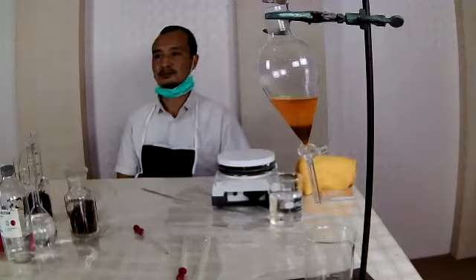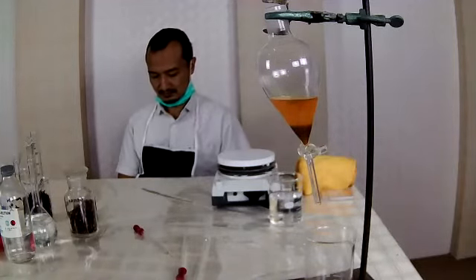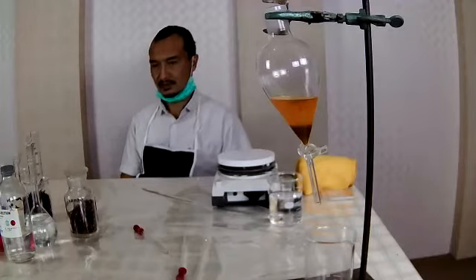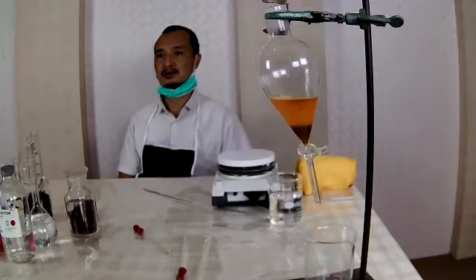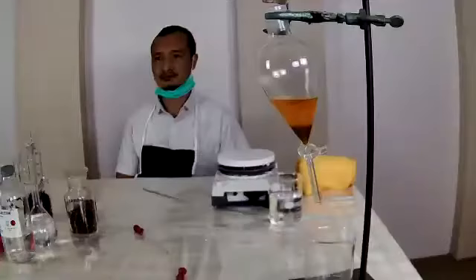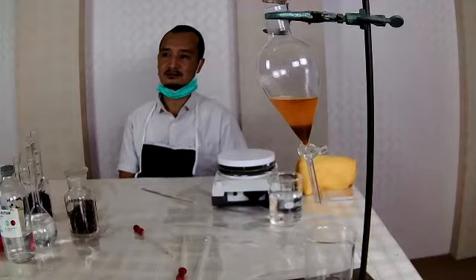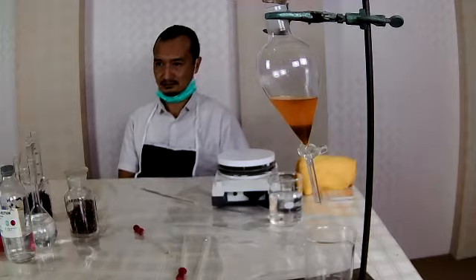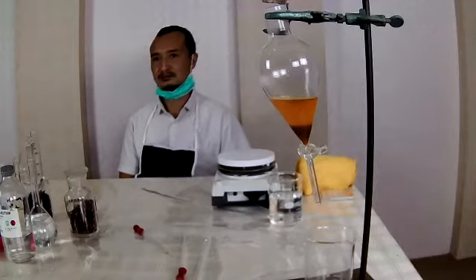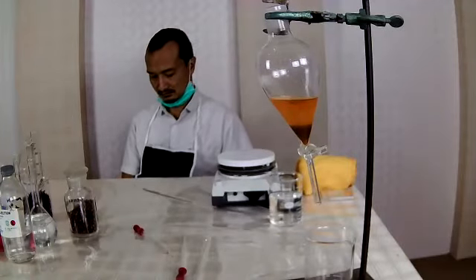We can see that the wood is more glowing, it's cleaner, and also the color somehow is brighter. I think that's the feature we can most clearly observe from the items where we apply the tobacco solution.